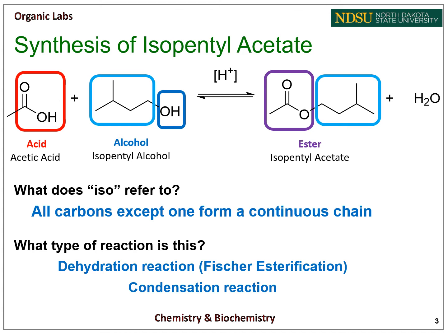What type of reaction is this? It's a condensation reaction, which is a class of reactions in which two molecules combine, usually in the presence of a catalyst, with the elimination of water or some other simple molecule. The type of condensation that we will be doing is a dehydration reaction, which will eliminate water. The popular example which we will be doing is a Fischer esterification reaction.